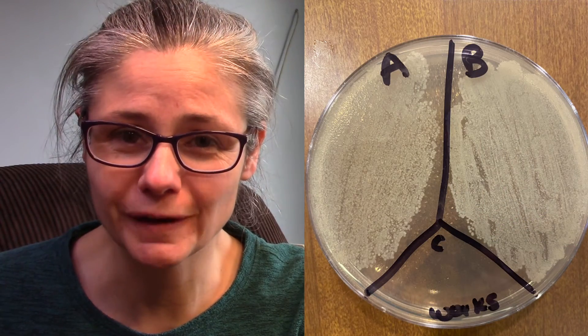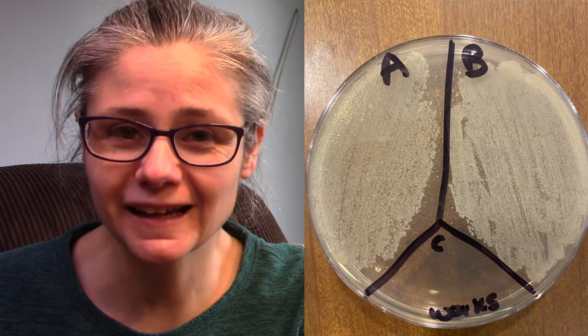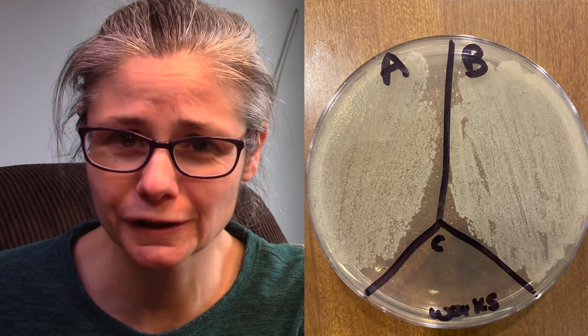Now for some results. The before section is full of bacteria, and the after section is also full of bacteria. So I have to say that The Works does not work in disinfecting my toilet bowl.